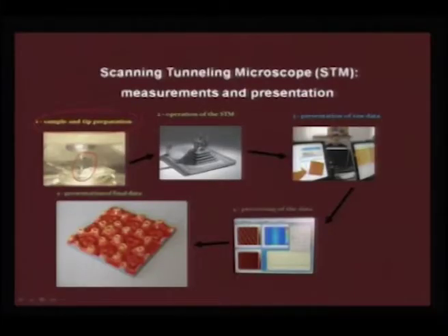So, what you precisely do is cover a lot of frames of this sort of pictures, and then you try to analyze that. You can try to verify whether the images are as expected, and then you can do a variety of things with every frame that you are recording.